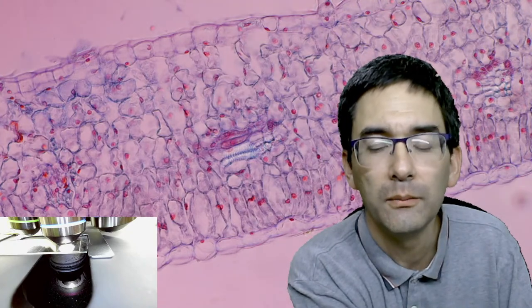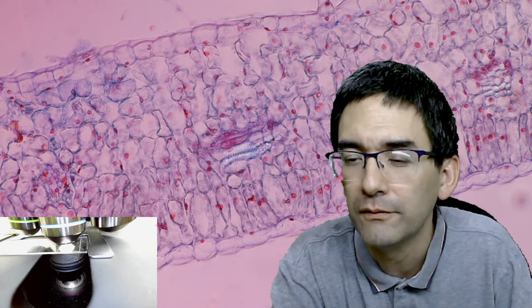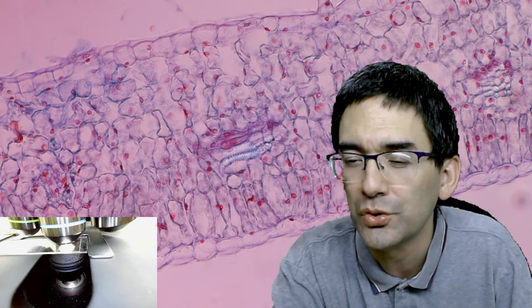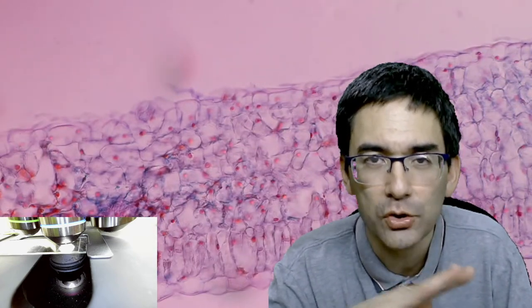That's again xylem - those spiral-shaped structures. So this was basically a short intro to making leaf impressions. Someone commented about identifying plant parasitic fungi like rust fungi, smut fungi, and mildew - yes, I could show some of them. Some people once sent me leaves they thought had a fungal infection, but when I put it under the microscope they turned out to be trichomes - star-shaped hairs that looked like a fungus without the microscope.